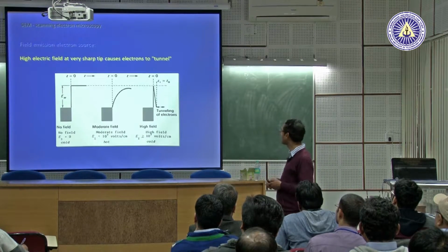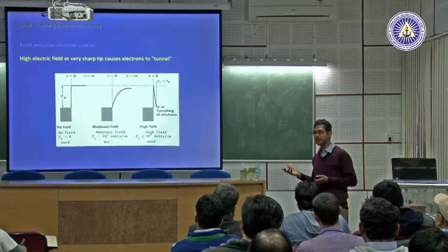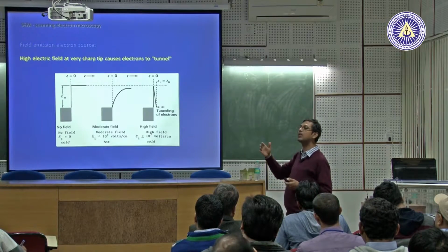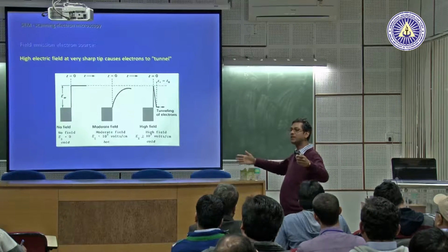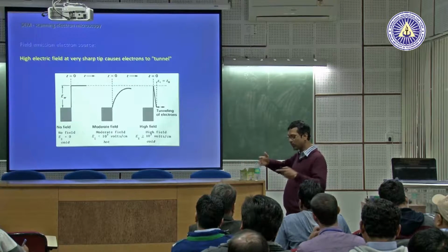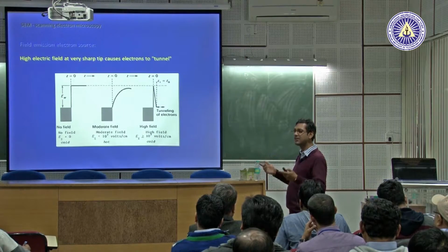In tungsten filaments, what happens? You are heating it up, and you cannot heat the filament uniformly. Because of that, the electrons which come out will have different energies, correct? And because of that the spread of the wavelength of electrons will be large. As you know, when the electron wavelength spread is large, you have more aberrations because of the lenses. It's very simple.